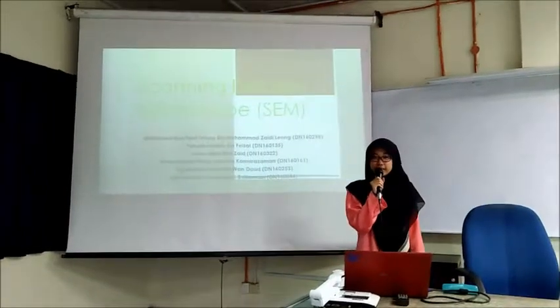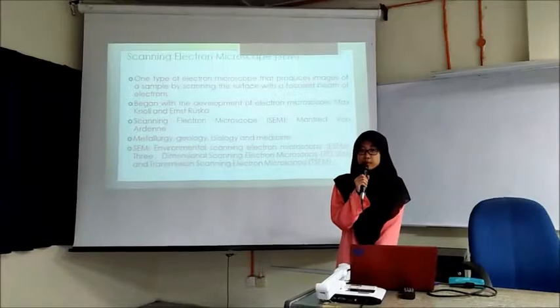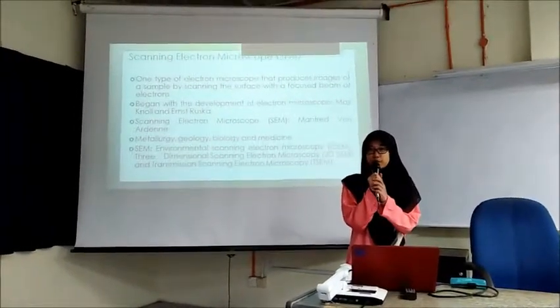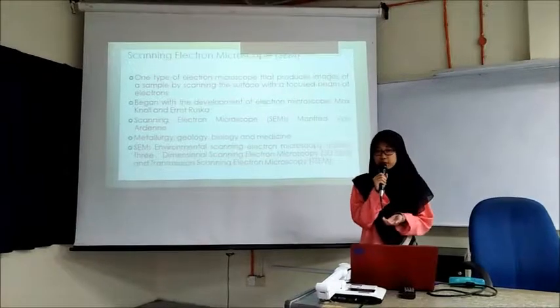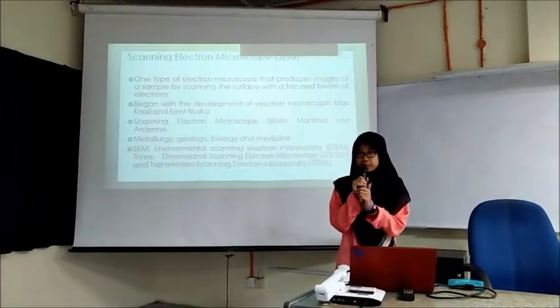We will present about the scanning electron microscope. The scanning electron microscope is one type of microscope that uses electrons as a substitute for light to produce the image of the sample. The image of the sample is produced by scanning the surface of the sample with a focused beam of electrons.